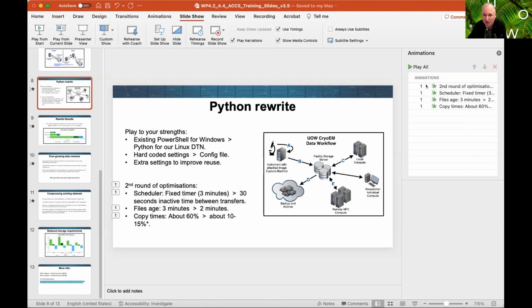Obviously, the microscopes aren't running 24/7. So once a data run has finished, that backup process catches up. But while it's running, that backlog of data that needs to go to backup, even when the script is running, is being generated faster than we can write it to storage.